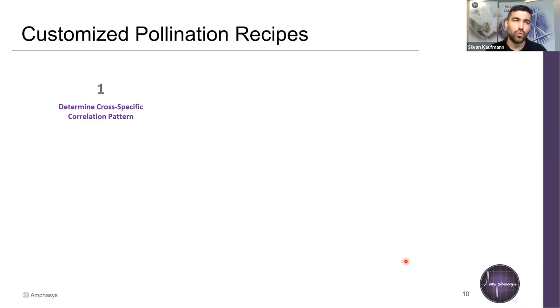And in the third step, you come back to the pollen or the actual pollination, and you perform the following experiment. So basically you pollinate with a wide range of pollen qualities, ranging from 0% viable pollen to the best you can get. And what you will get is something like the following. If you don't apply any viable pollen or very little viable pollen, you will hardly get any seed set. If you start applying more viable pollen, you will get more seed. So the more you apply, the more seed you get. So in this part of the experiment, the pollen is the limiting factor of this whole system.